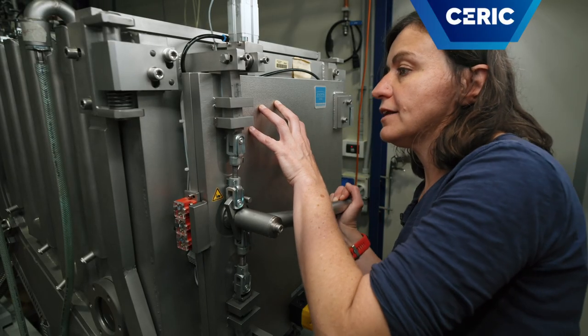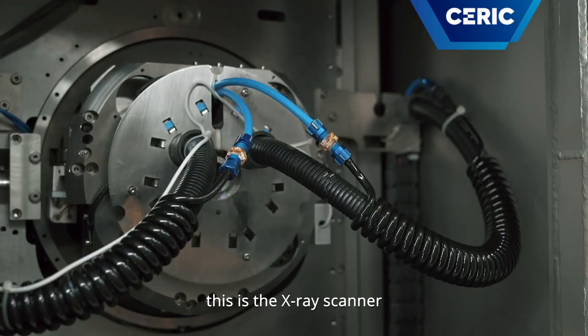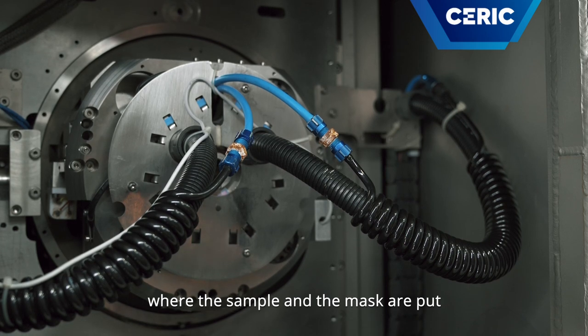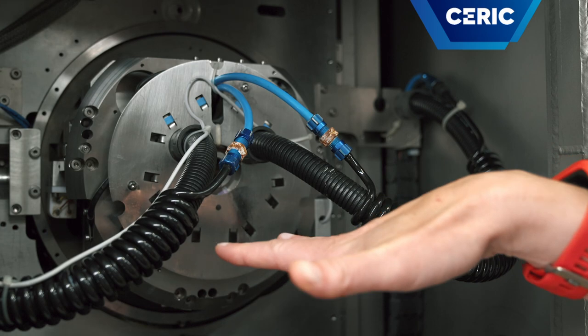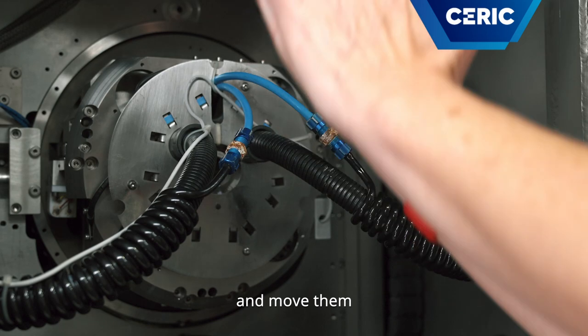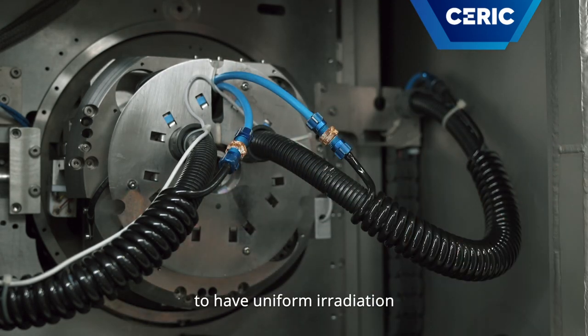Now I open the scanner. This is the X-ray scanner where the sample and the mask are placed. As the X-rays arrive flat, we have to move the mask and sample up and down in front of the beam to have uniform irradiation.